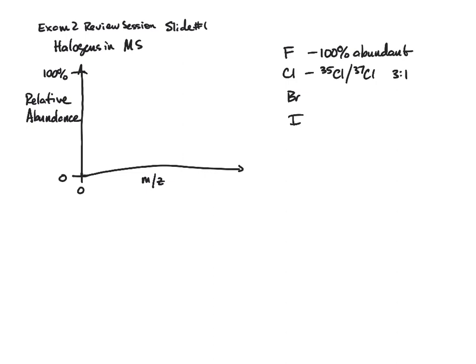So what does that look like if you were to see a parent? The parent is the ion that has the highest mass, and that is the mass that contains every element of the molecular formula. So just estimating here, that's like a 3 to 1 ratio.